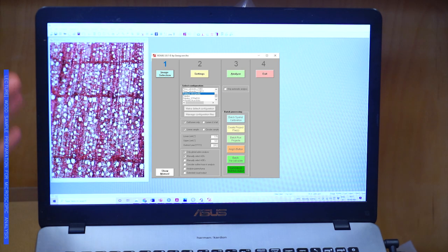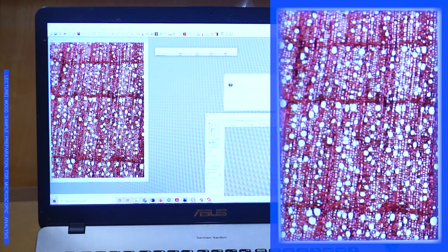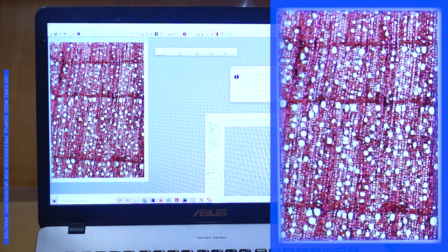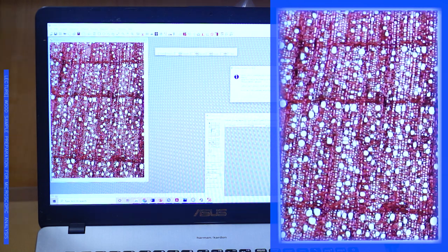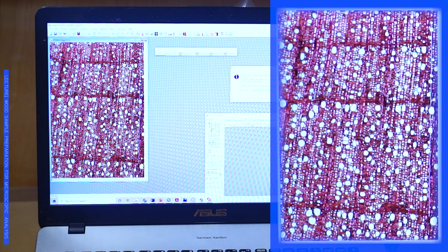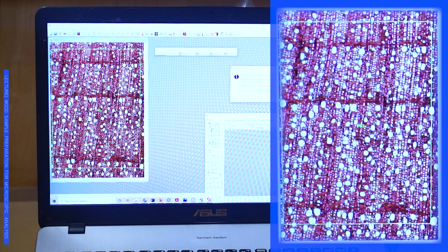Okay, so when we already have the image ready, I want to show you the automatic analysis that this program does. I have already set it for the species that we want. It will just ask me to find an area of interest. I will tell it to analyze a square here, comprising three rings. And okay.